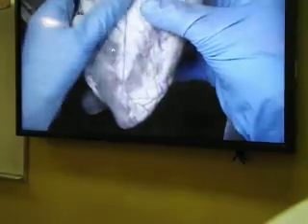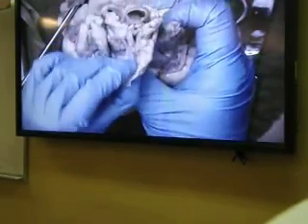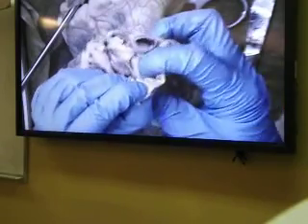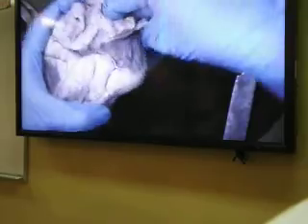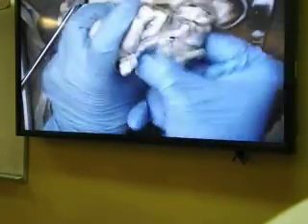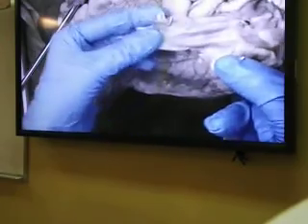So this is the posterior aspect of another heart, and this is close to the right atrium. I see there is a hole, a very thin hole. So if I push, this has to be the superior vena cava, and I can push my finger through it and see, is it really? Yes, it's going to the right atrium. But see how far the inferior vena cava would be. All the way here is the inferior vena cava, and part of it is actually covered with fat.